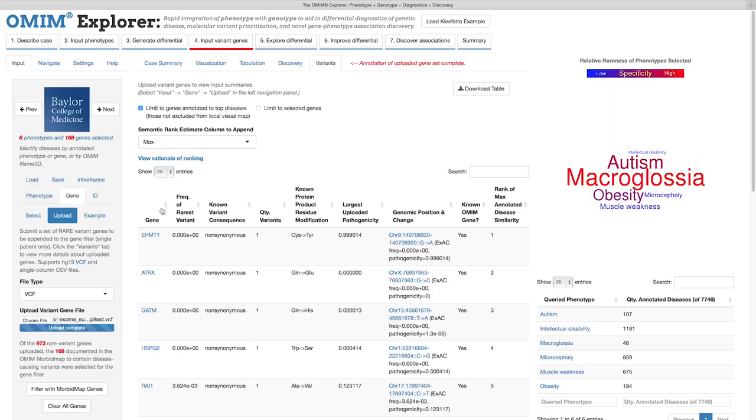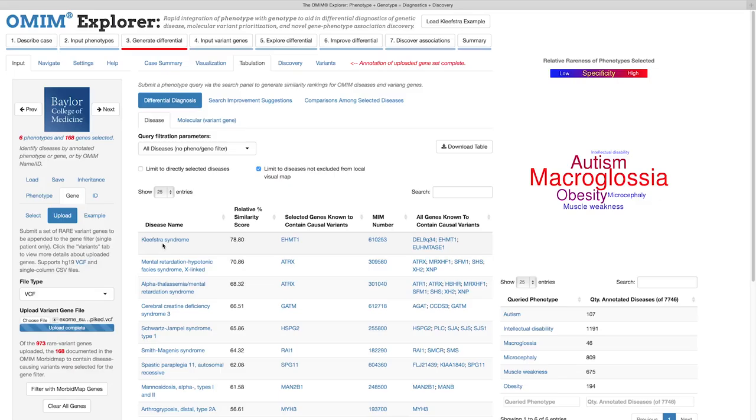If we go back to Step 3, we can also see that the disease differential has been automatically filtered to only diseases causally linked to the genes we just uploaded, giving Kleefstra Syndrome the top spot.